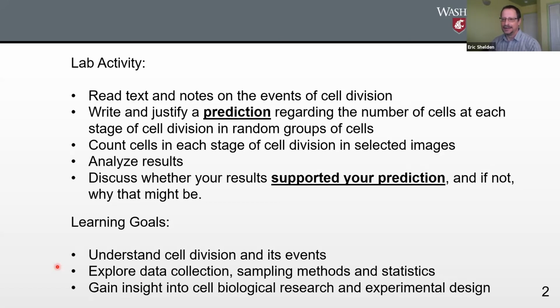For example, if students are assigned a relatively small number of images to analyze, then the results they're going to get are going to be very different from each other. And if we combine the data from several students, they might get a more accurate picture of what's going on in the data set. And then finally, to get some real experience working with actual cells. Surprisingly, even seniors may have gone through 4 years of biology education and never seen an image of a real cell. And so sometimes they're initially a little bewildered by what they're looking at. So that's a neat experience for them.